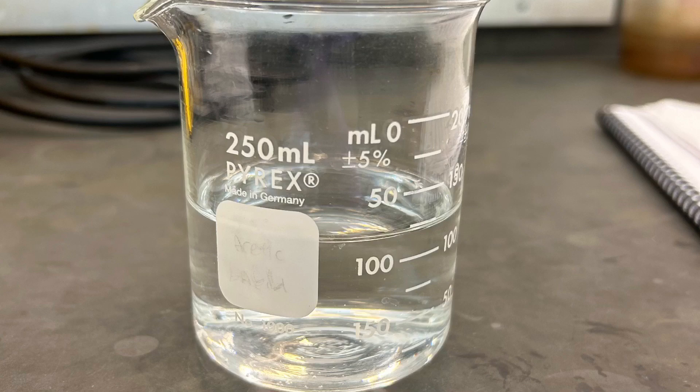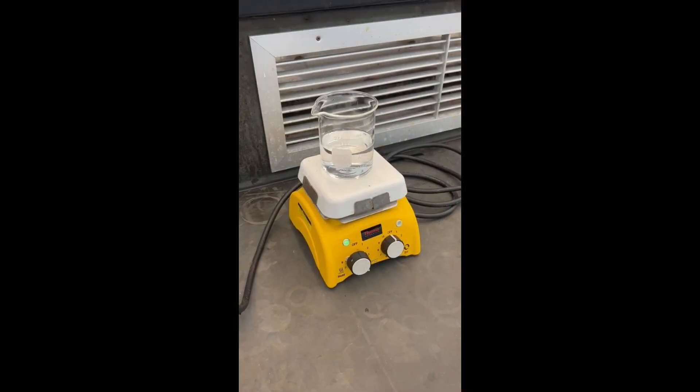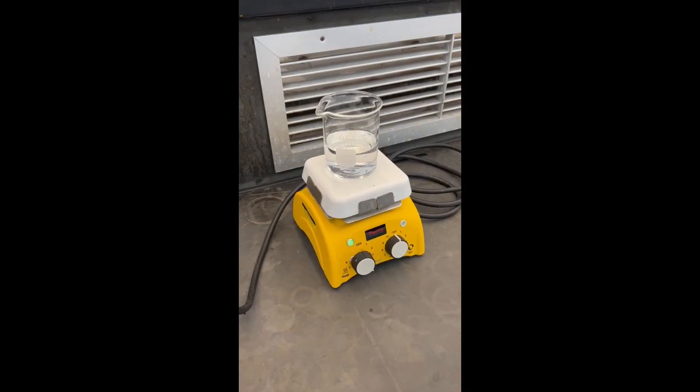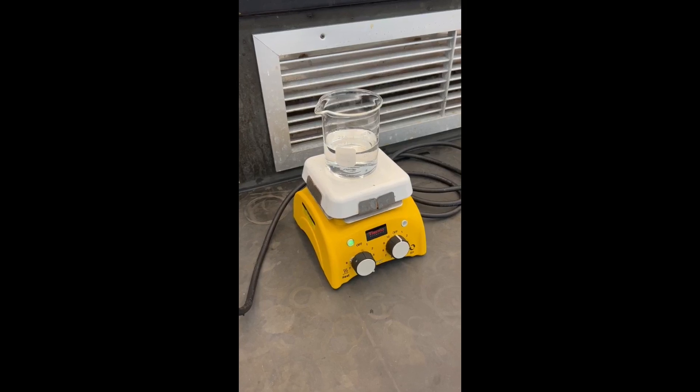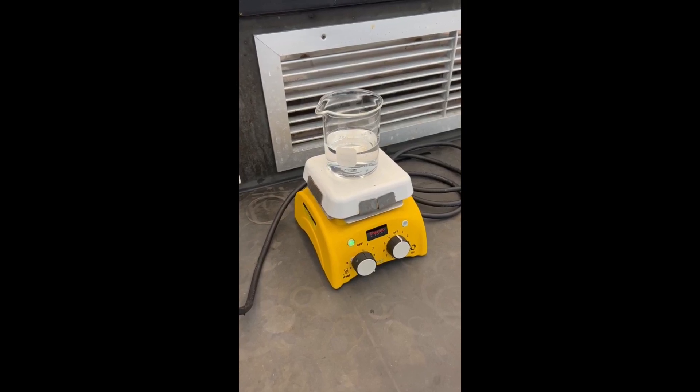To start the saponification of fat for Part B, prepare a hot water bath by filling up a 250 milliliter beaker with water and adding two to three boiling chips. Then put it on a hot plate to heat up until it boils, then put it on low heat to simmer. Keep an eye on it so the water does not splash too much.